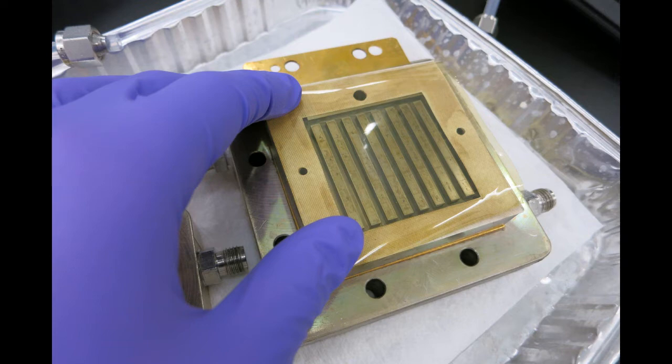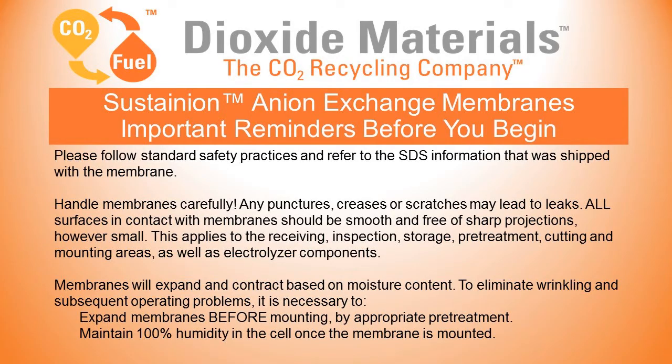Everything is set to go. Important reminders now that you saw how easy it is to remove the membrane from the liner: please follow all SDS information. Handle the membranes carefully — any punctures, creases, or scratches may lead to leaks. Make sure that all surfaces are smooth and free of sharp projections.